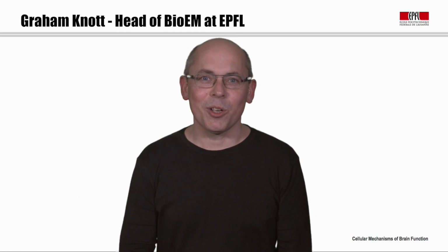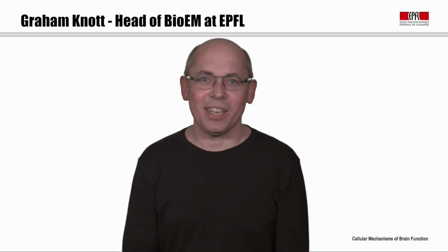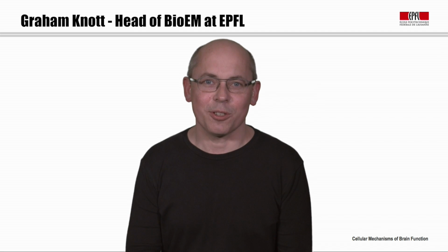In this video, we're going to take a look at the structure of synapses using electron microscopy. And to introduce you to electron microscopy, I'd like to welcome Graham Knott, who heads up Bio-EM at the EPFL. He's a world expert in electron microscopy.